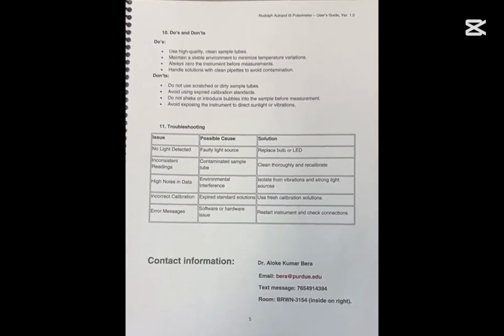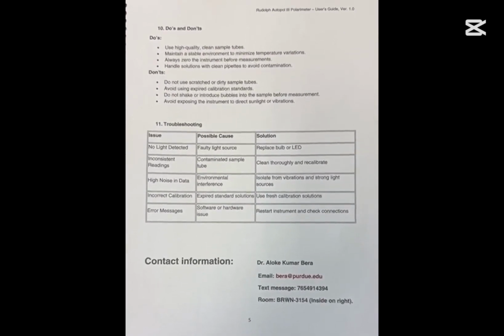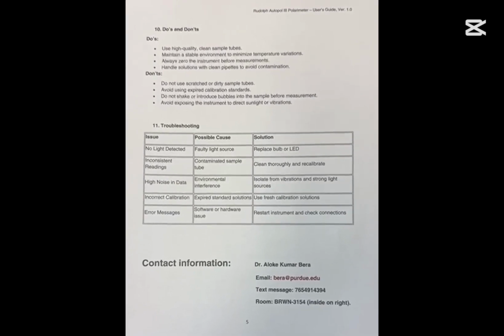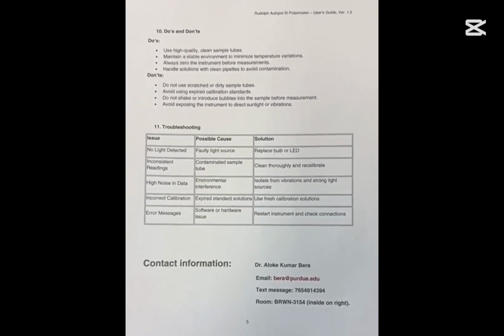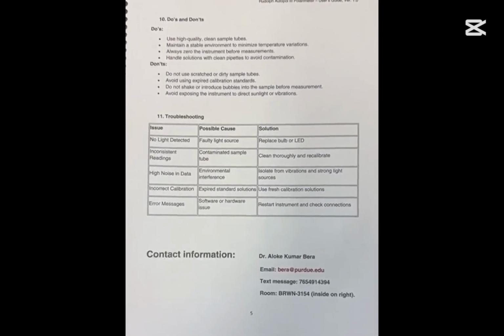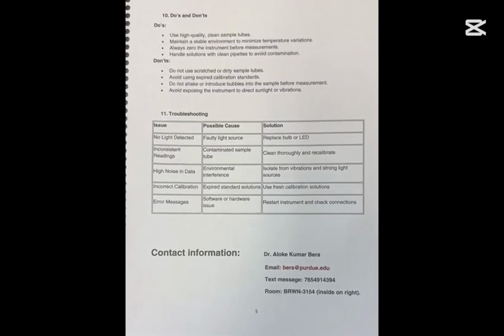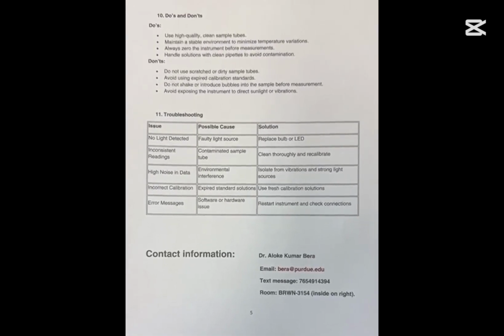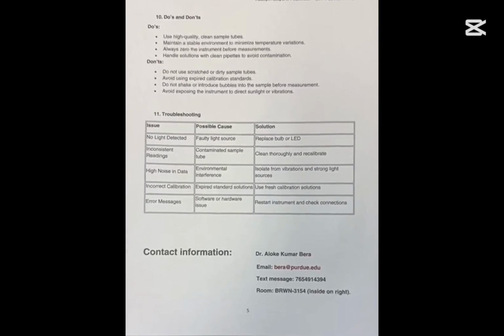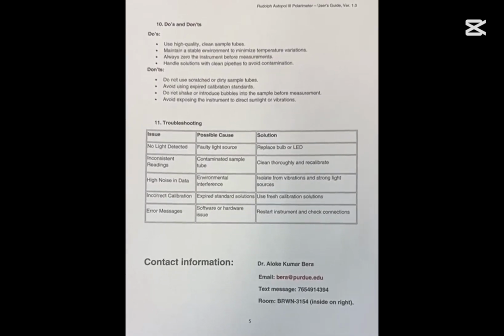Here is some additional information for the polarimeter experiment. Please follow those things for better results, and also troubleshooting information. My contact information is also here. If you have any questions or problems, please contact me.